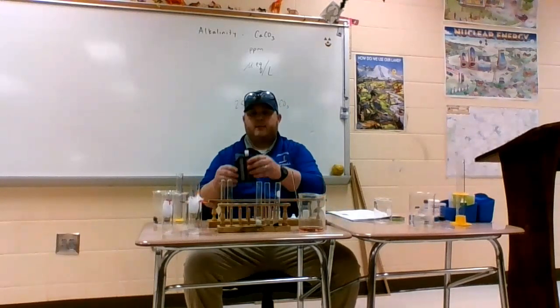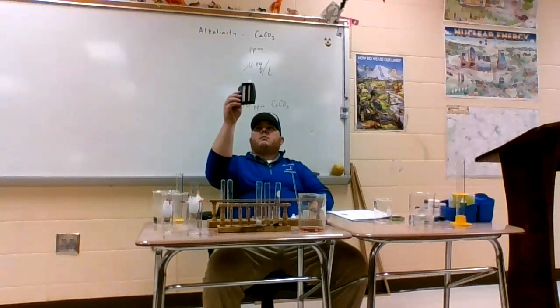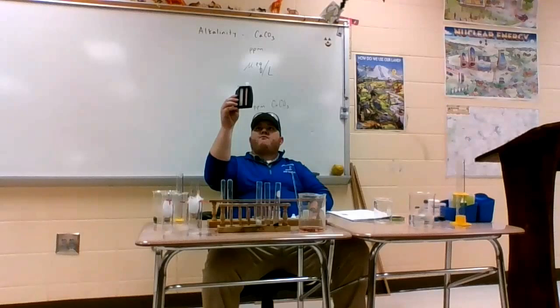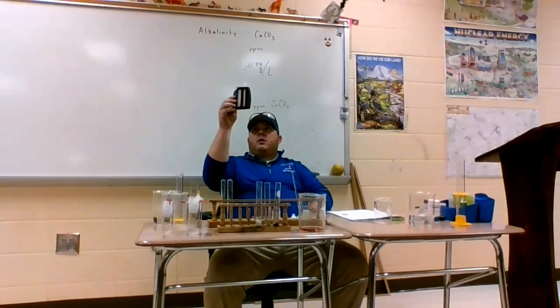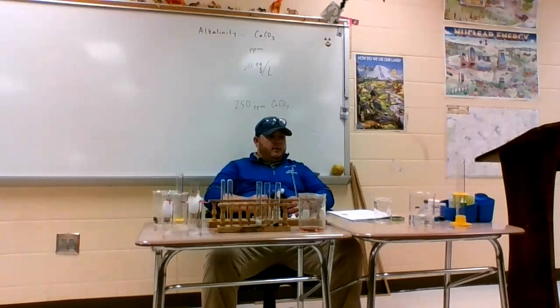So, get over. That one is the same as marble. This is marble. I'd say 3 to 3.5 again. You're all lizard people. I'd say this is between 3 and 3.5. I was right.